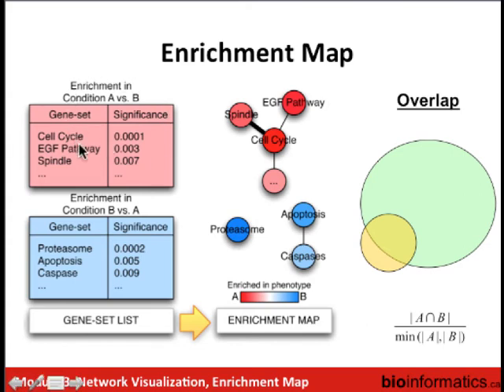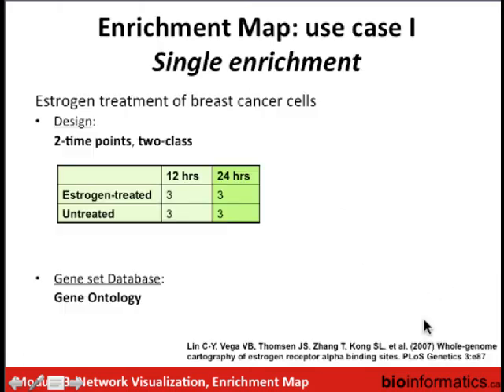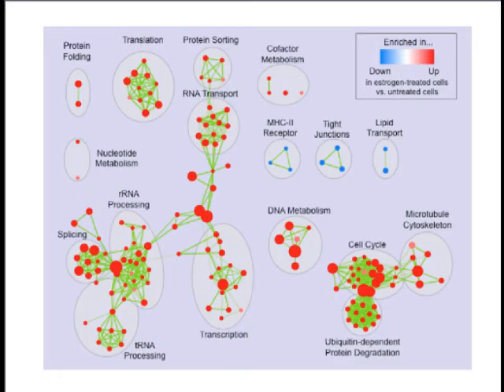For this demonstration we used a published dataset of gene expression measured from breast cancer cells that were treated with estrogen or untreated, with multiple time points. At one time point they had three replicates of estrogen-treated cells versus three replicates of untreated cells. We ran pathway enrichment analysis with GSEA and then made an enrichment map. In the GSEA case, pathways enriched in the top of the list are colored red, and in the bottom are colored blue — so red is enriched in condition A versus B, and blue is enriched in B versus A.